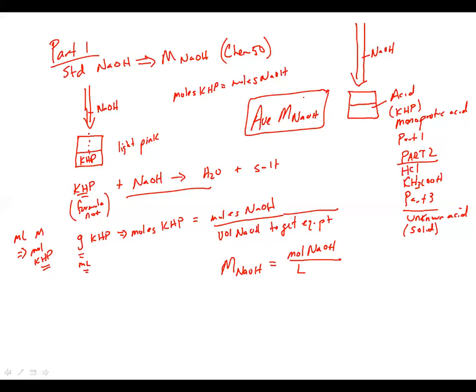You're going to stop at the equivalence point. You're going to do some calculations to standardize your sodium hydroxide through the simulator. You'll get an actual molarity of your sodium hydroxide, and technically you would use that molarity for the rest of the parts of the experiment. Any questions on part one of the experiment?